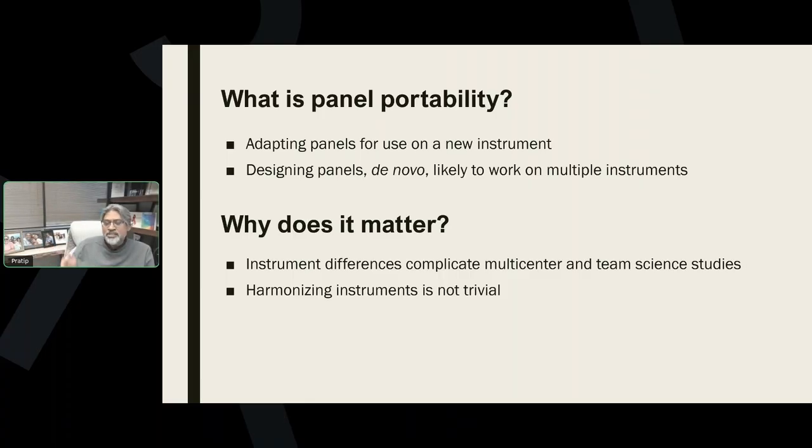The antibodies will be listed in the panel in the paper for these OMIPs, and we can try to translate these off the instruments that the OMIPs were developed for onto new instruments. And we have some examples here at Talon where we have taken existing OMIPs that were developed on, for example, an Aurora, and we've translated them to our Thermo Fisher Bigfoot, or translated them onto our Sony instrument.